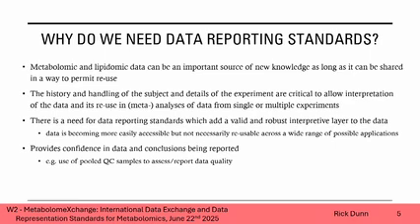So why do we need data reporting standards? Well, basically, it's an important source. Okay, if you think about all that data that you're submitting, hopefully, all of you, into the data repositories, it's a really important source of new knowledge, okay? But to be able to use and reuse that data, you need to know about the data and how the data's been collected. So everything from the start of the experimental design all the way through might be relevant within those reporting standards, and that's what we're thinking about. Whether it's for one experiment or for multiple experiments.